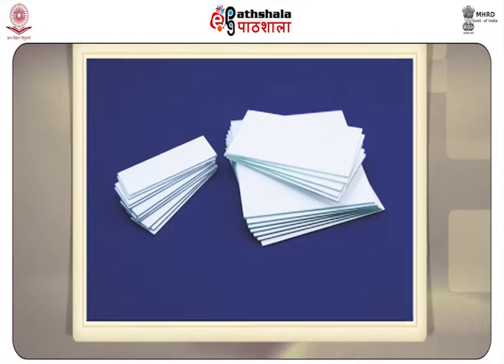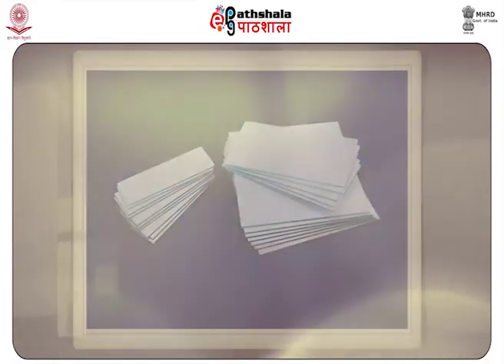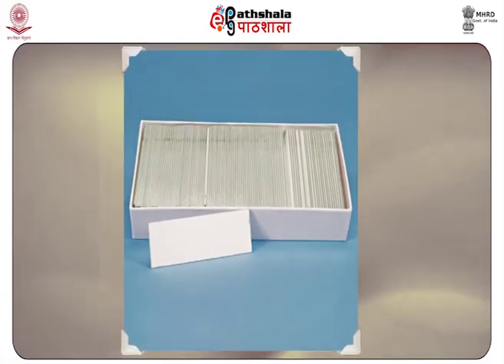Generally, the TLC plates are commercially available with a wide range of particle sizes for improving the results obtained. Such plates are made up of adsorbent materials like silica gel mixed with a small quantity of inert binder, commonly water and calcium sulfate. This mixture is coated in the form of an even layer on an unreactive carrier sheet, usually plastic, aluminum foil, or glass.